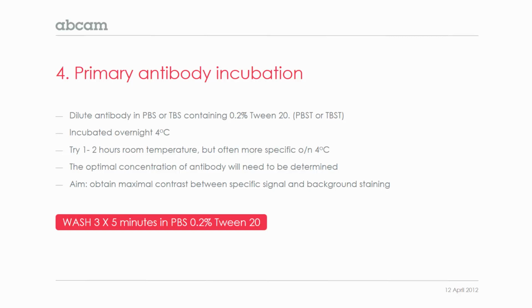We would recommend to incubate overnight at 4 degrees. 1 to 2 hours at room temperature does very often work, but usually the staining can be more specific if you incubate overnight at 4 degrees.